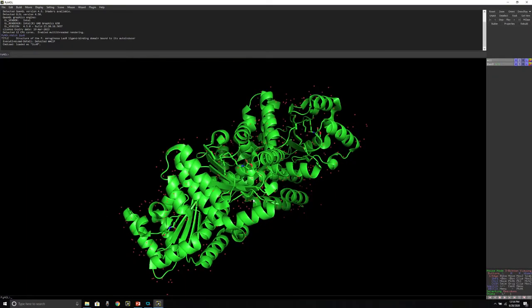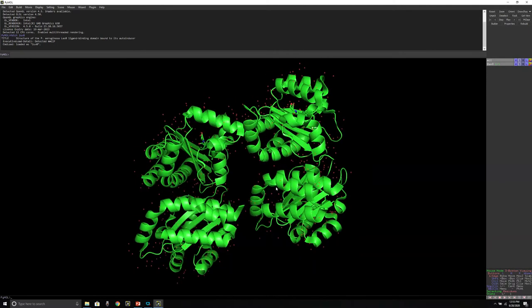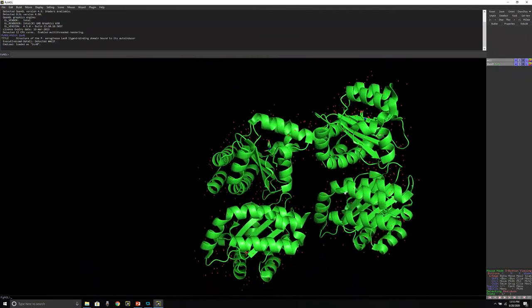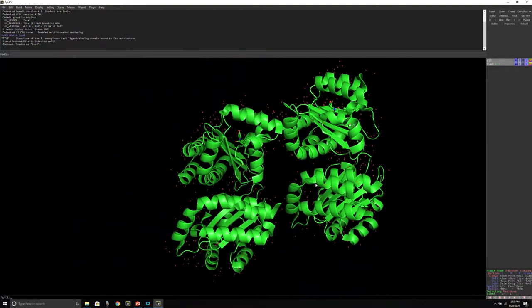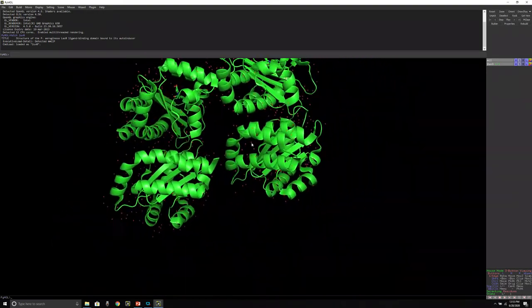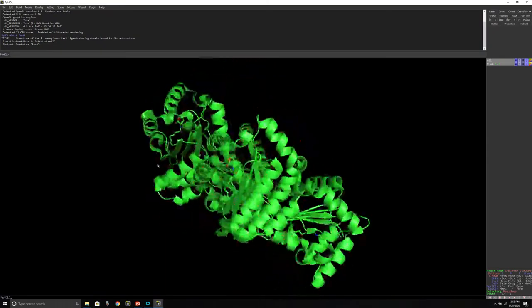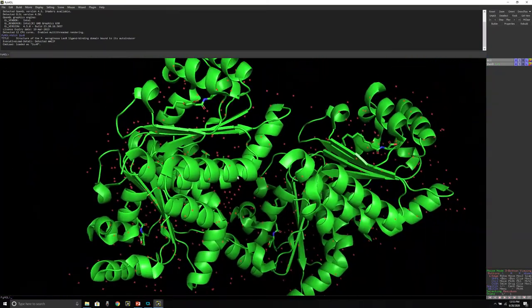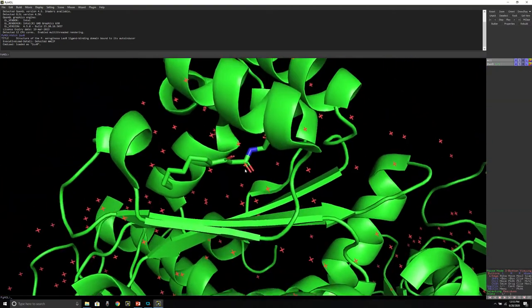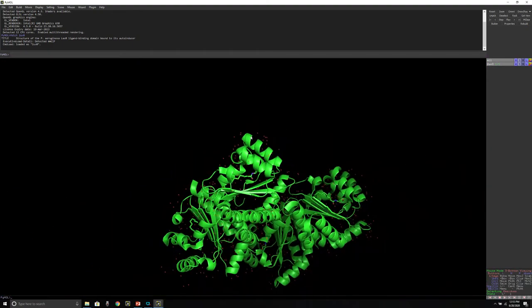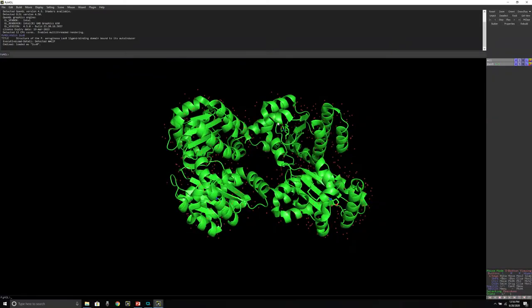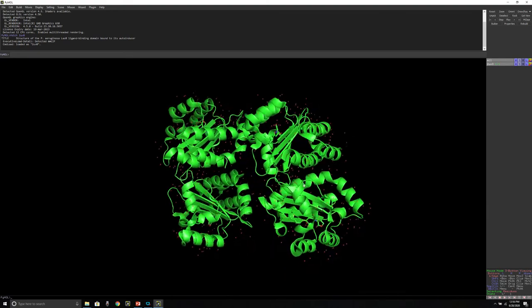The third important control is the scroll button — the central button between the left and right click buttons. Press and drag with the scroll button to translate the entire protein and change its position in the display window. It's very useful to combine all these mouse controls: rotate with left click, zoom with right click, and pan with the scroll button.